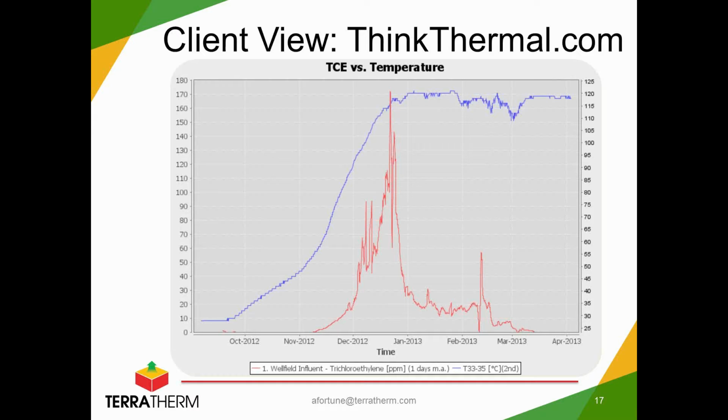So this particular site originally had a requirement to monitor the effluent vapor coming from the thermal oxidizer out the stack on a daily basis. If we had done daily laboratory samples on a fast turnaround time, that would have been extraordinarily expensive and just a lot to manage.